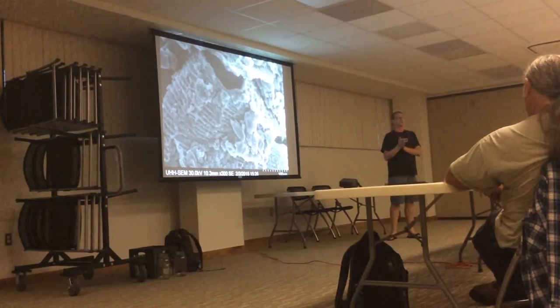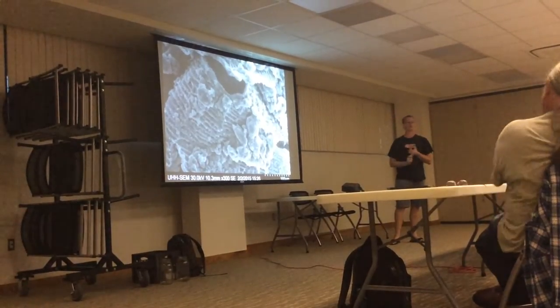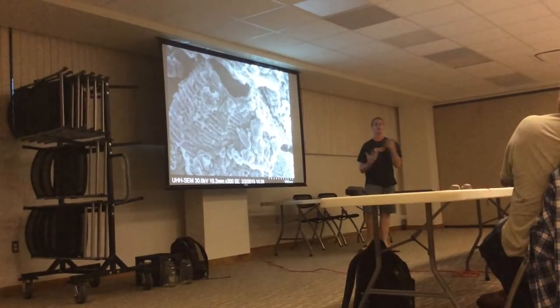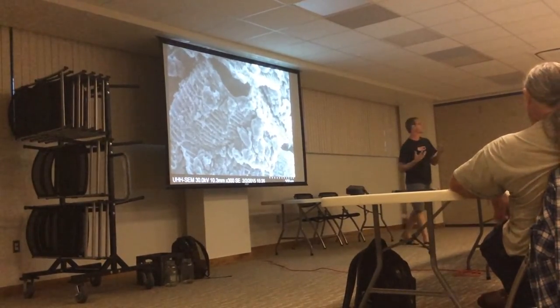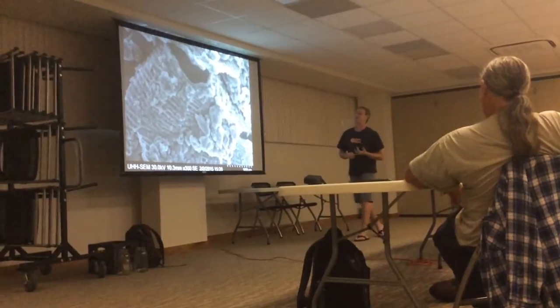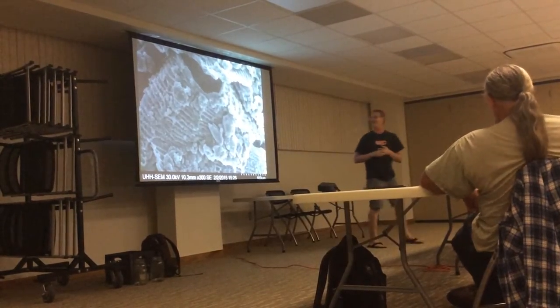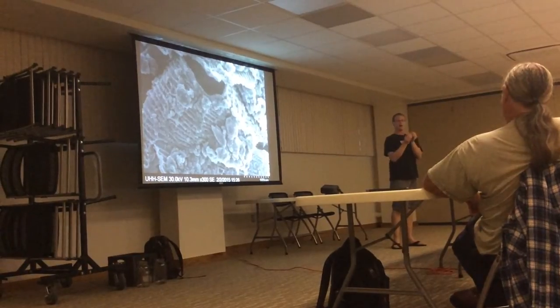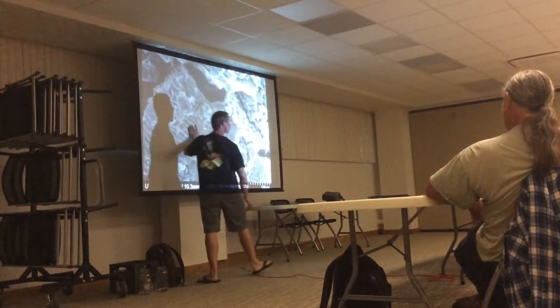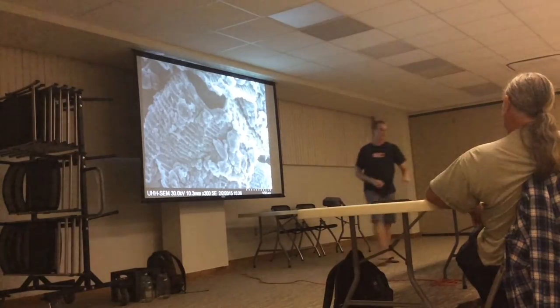And this is the first sample that I took. This was created at 100 feet elevation, this IMO4 sample, and this was on a macadamia farm, and it had very little outside material. When you mix IMO4, sometimes you get leaves and soil from the outside environment - this is actually pretty well protected. So most of the material that you see in here is that mill run. The mill run magnified a lot of times will look like this scaly construction of cells. And what that is, is actually the hull - the wheat hull - and that's elongated plant cells. These are basically building blocks, the inside of the hull of the mill run. And of course microorganisms all over.